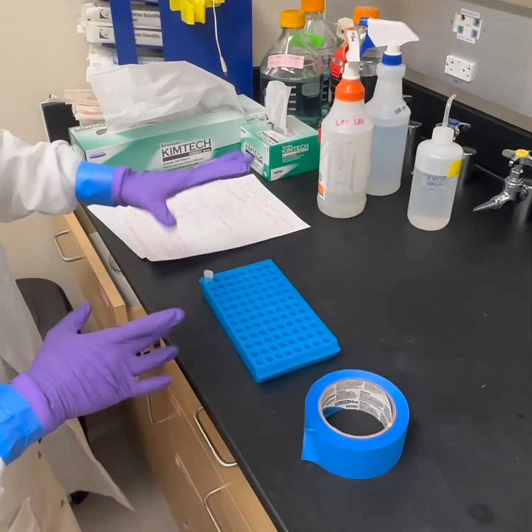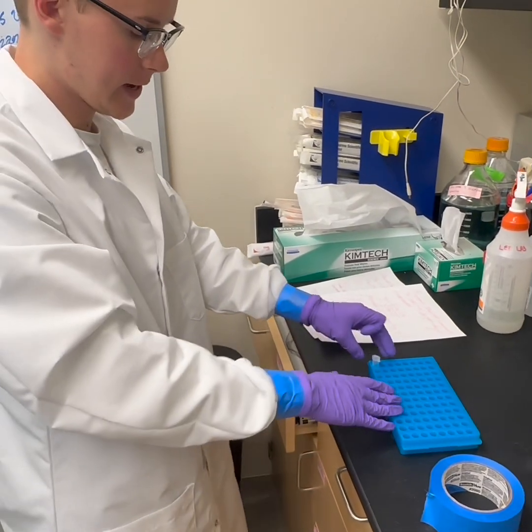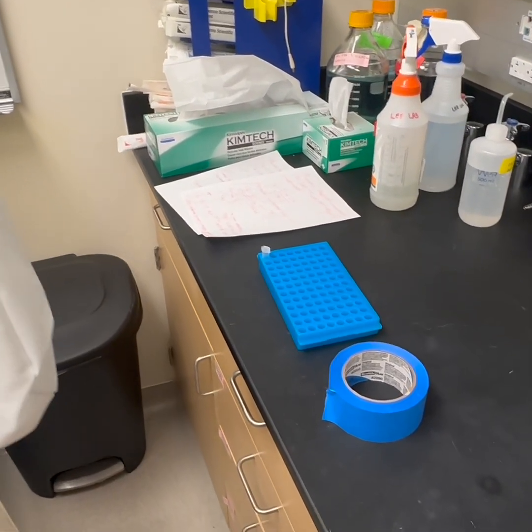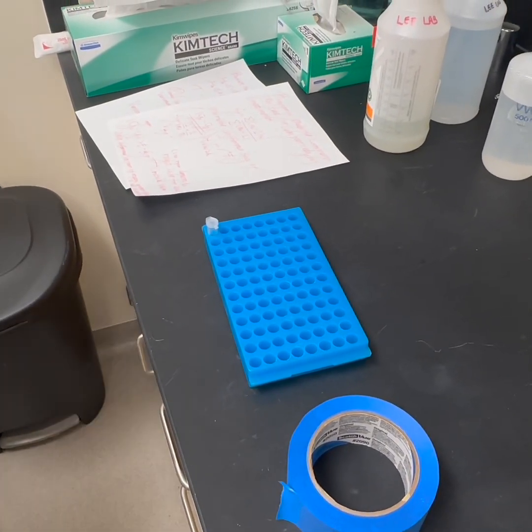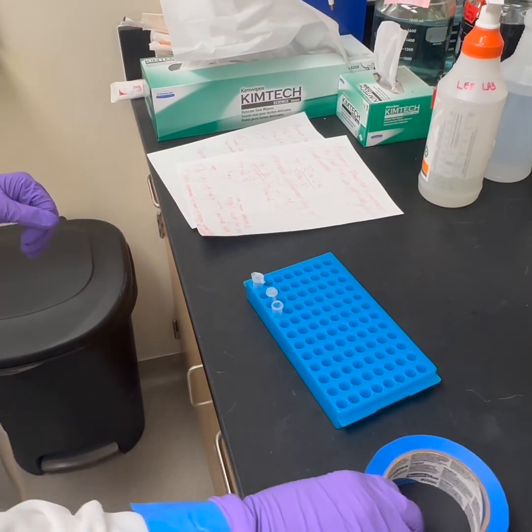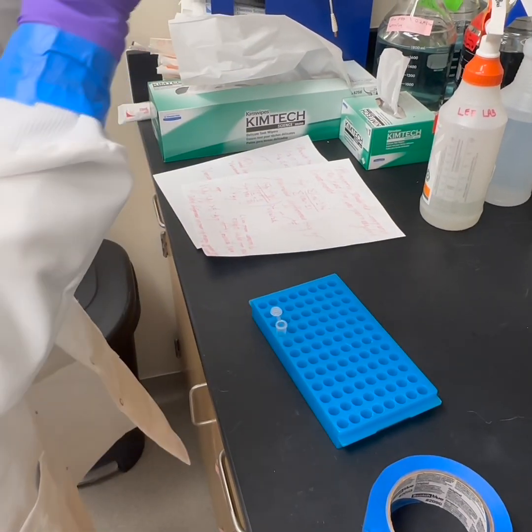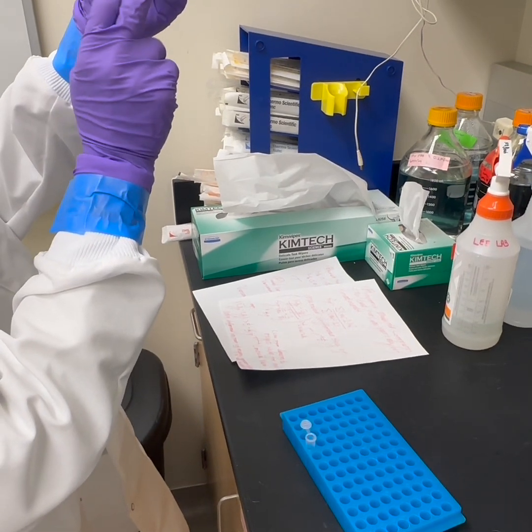We found that for an overnight culture, a 1 to 250 dilution is good for the initial dilution, and then around a 1 to 2 dilution is good for the confirmation count after you make your dilution. So right now we probably have somewhere around 1 times 10 to the 8th cells in there, and we want 1 times 10 to the 6th. So we're just going to count these, do some math, make a dilution.